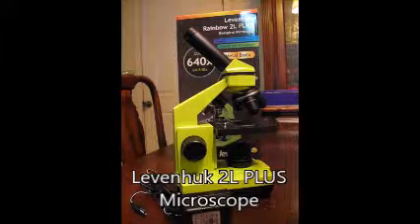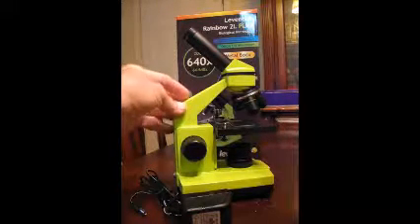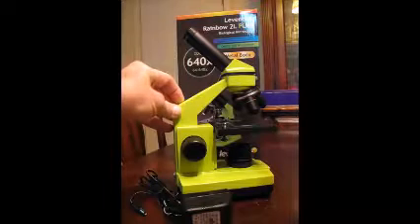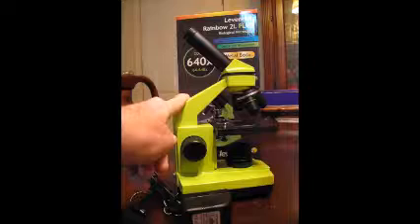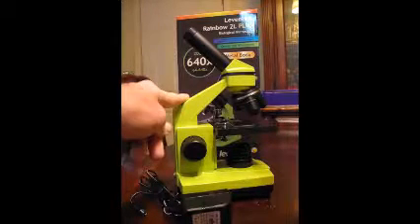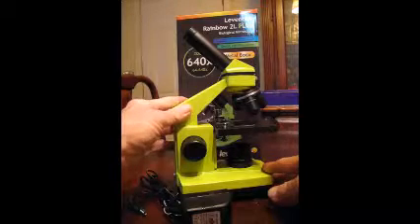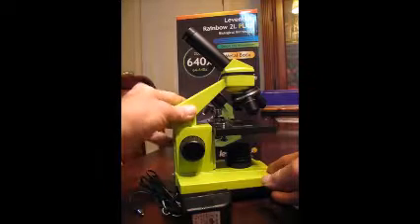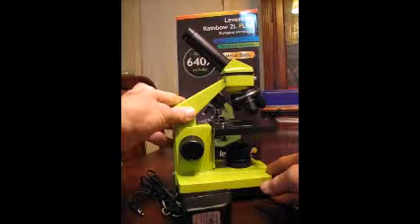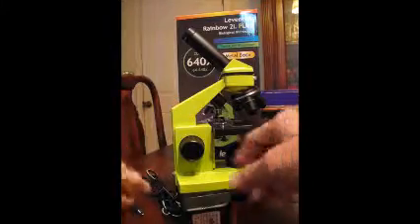We're going to take a look today at the 11 Hook 2L Plus microscope, which comes in several colors. This one, as you see, is lime green. I'd like to point out this is not a toy — this is a real working microscope, and I've had a lot of fun with it for the last two or three days. The frame itself is metal; there's nothing flimsy about it — it's very solidly made.